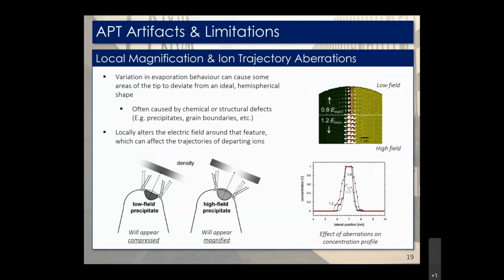And if it's something that you're doing intentionally, like say when you're making your sample using the FIB, I would highly suggest you avoid such an orientation, because you can foresee these problems ahead of time, in varying evaporation fields and having them side by side, and try to put them as we did, where we have one phase and the other phase stacked on top of each other.